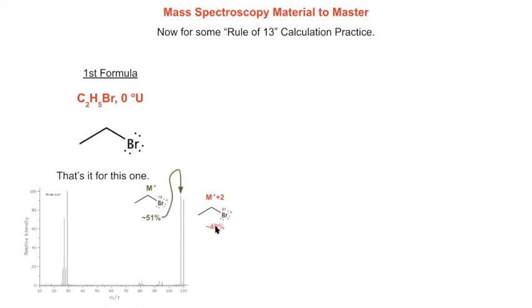And then there's about 49% bromine 81. So that causes this slightly shorter peak, 49%, at 110. Pretty cool, huh? So when you see a mass spectrum, I like to give bromines on mass spectrum. So if you see one on the final exam and it's got like a doublet looking signal for the molecular ion, with the lighter one a little taller and they're 2 apart, then you should think, oh, there's a bromine in this molecule.